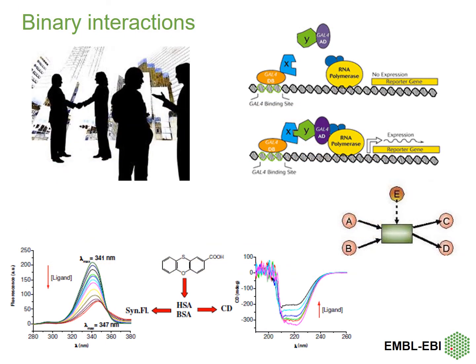And so binary interactions, two proteins coming together. We'll talk about the yeast two-hybrid in more detail. This is just a diagram here, Y2H. And this is just showing one of these diagrams of an interactome here.